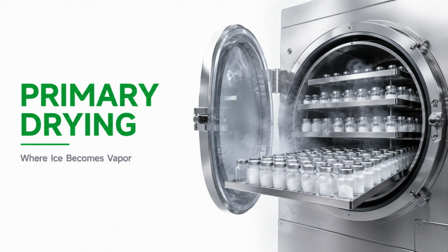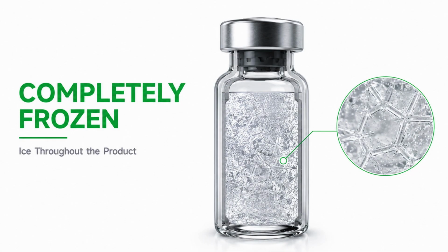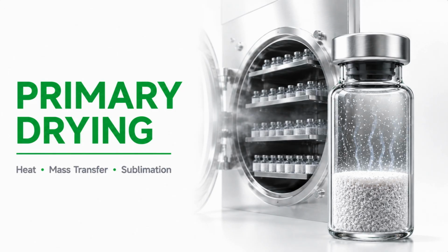The freezing stage is complete. Inside the freeze dryer, every pharmaceutical vial now contains a completely frozen product, ready for the next stage of the process. Primary drying begins as heat is transferred into the product. Ice sublimes directly into water vapor, and that vapor is transported out of the vial. Together, heat transfer, mass transfer, and sublimation determine the success of primary drying.